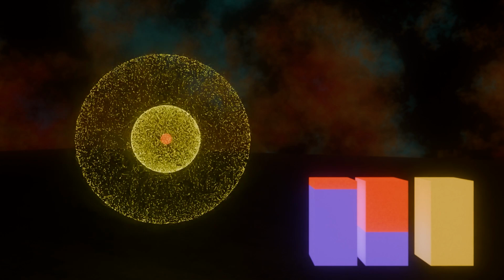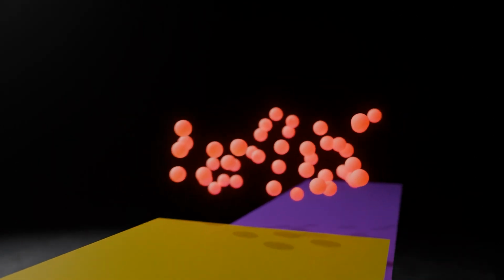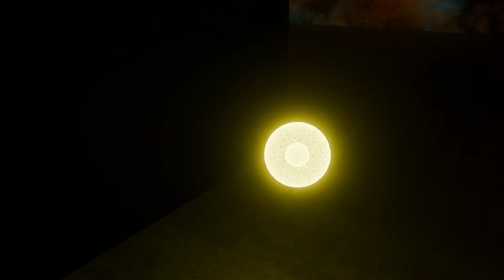Start with an ion. You fire a laser at it, you get some electrons, and you end up here? Like, how did we get here? How can you start with a gas, push it around in wacky ways, and end up with a graph based on a slice, based on a reconstruction, based on an image, based on a detection? What's going on? Well, that's what we'll get over in this video.